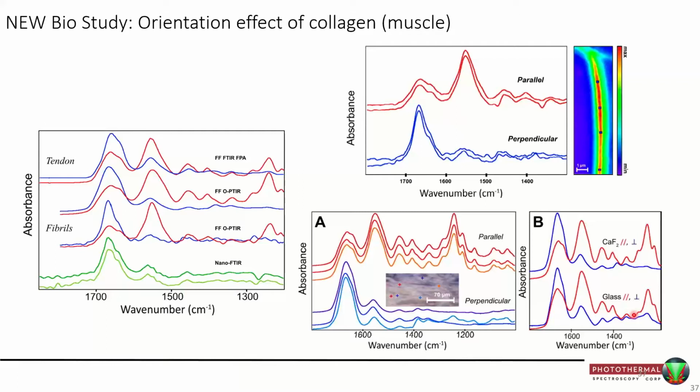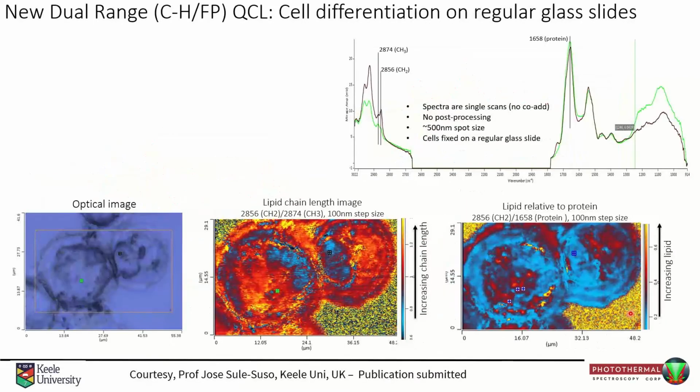Materials, tissues of perhaps several to 10 microns plus put on glass work completely, and there's absolutely no glass contribution to them. In fact, I should update this because the paper has in fact been published.